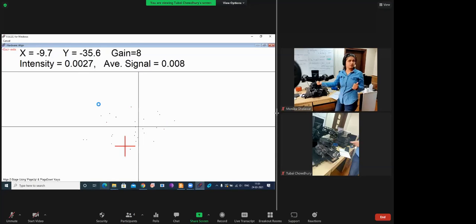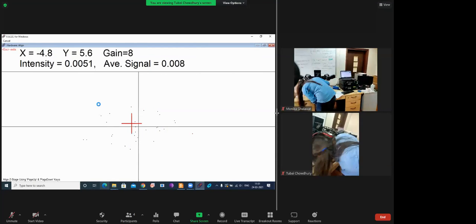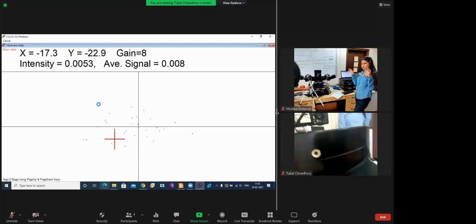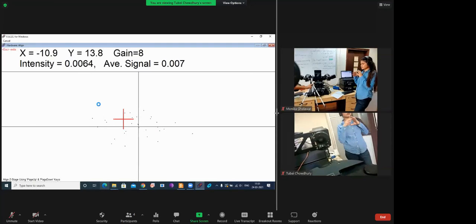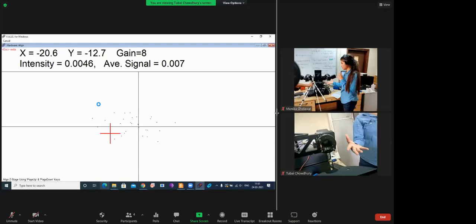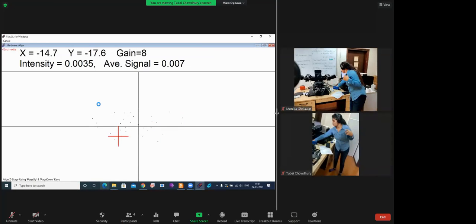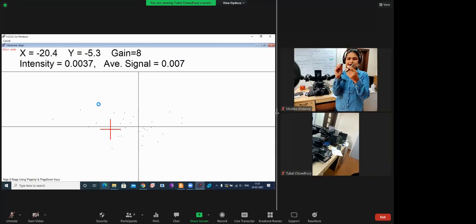Dubai, can you show them from zoom view? So it's not coming. That's why we are not getting any dark gray rectangle. Is it visible in that camera? Because it's very small. What's there is that the black spot is there and the white spot is coming here.